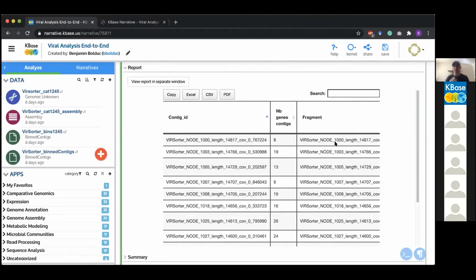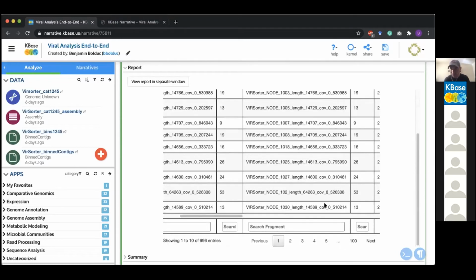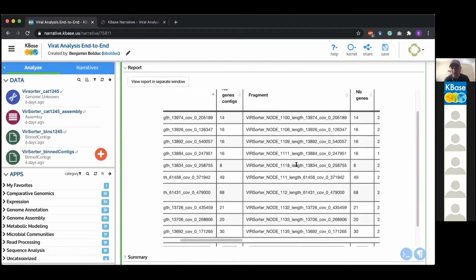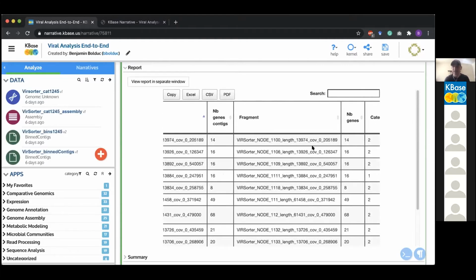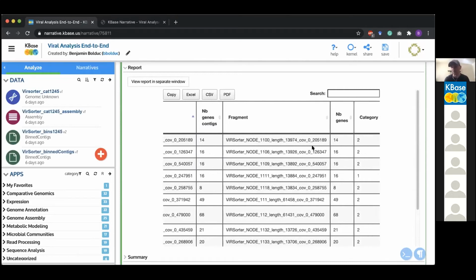That's because it predicted that whole sequence, or at least 80% of it, as viral. It is possible to see partial ones, of course, though I probably won't see any in the first couple examples, because we have a lot more non-prophage sequences in here, but you would see something like gene 5 to gene 55 would be the fragment they're from.